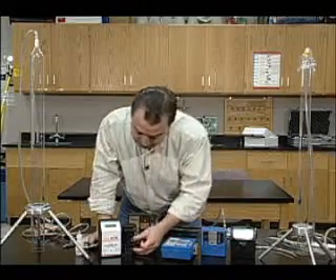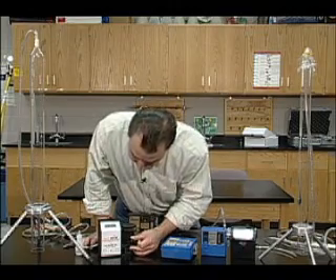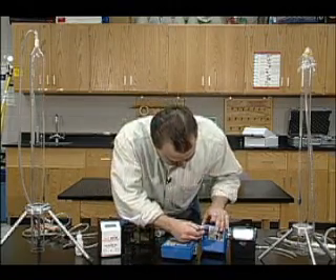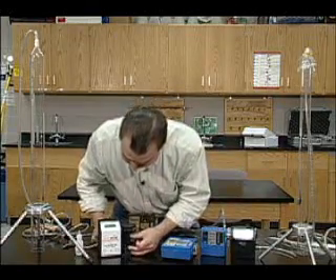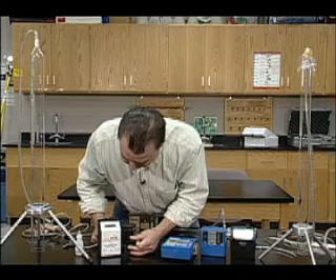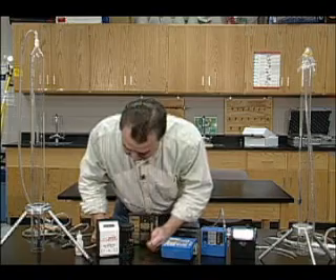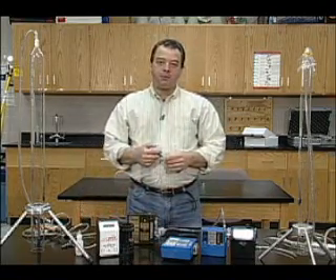As you can see, this can be time consuming. At 2.053 — that's pretty close. At 2.1, one more little adjustment. At 2.078 — I think we're pretty close. And that's how you calibrate a sampling pump.